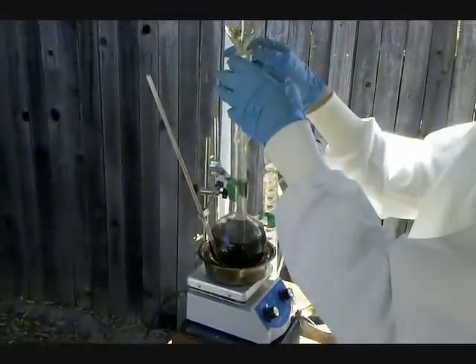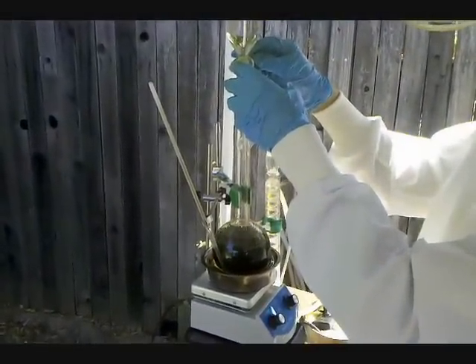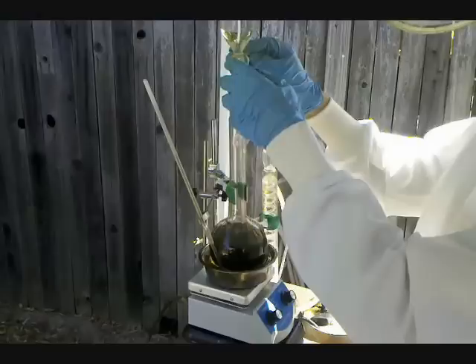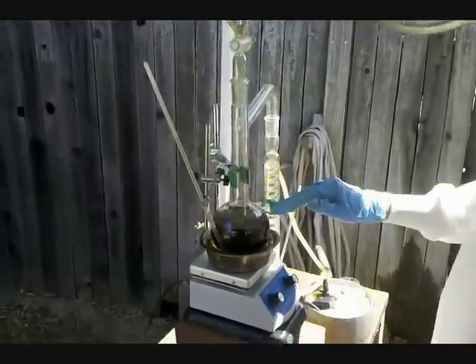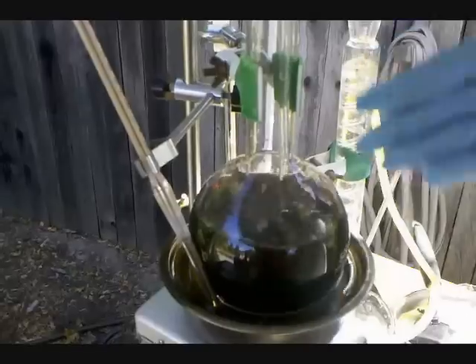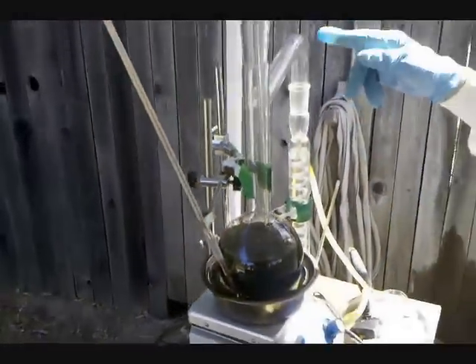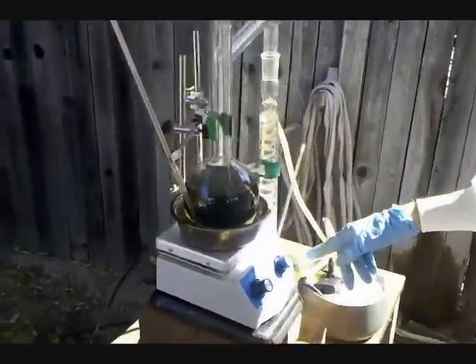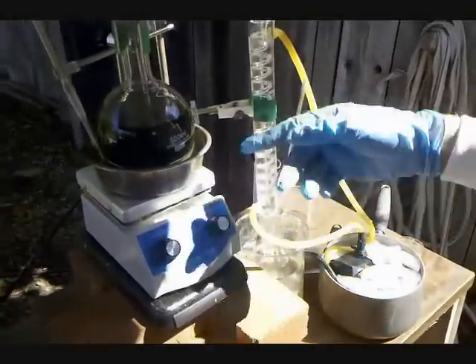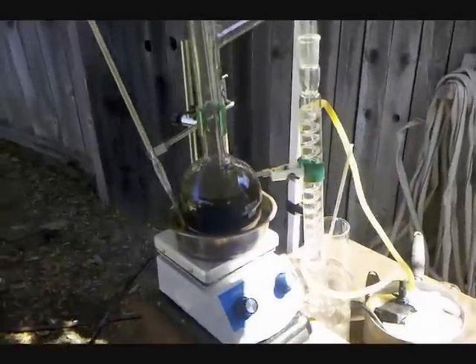I'm just adding ethanol slowly and keeping the amount of reactant in the vessel so it doesn't get too full. Pretty soon we should see ether start to condense down into the Erlenmeyer flask, because as you can see, there's a little bit of off-gassing going on in the reaction.